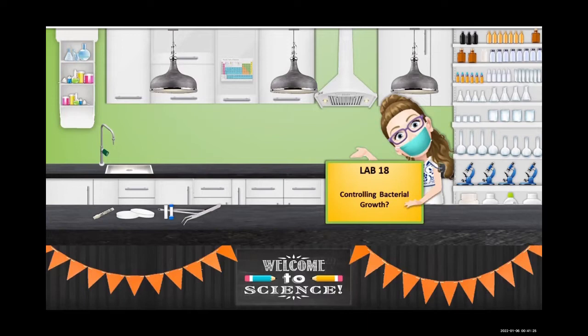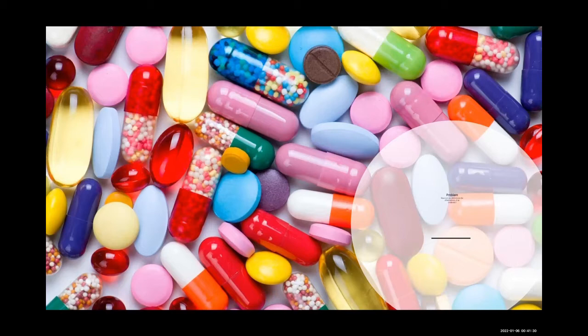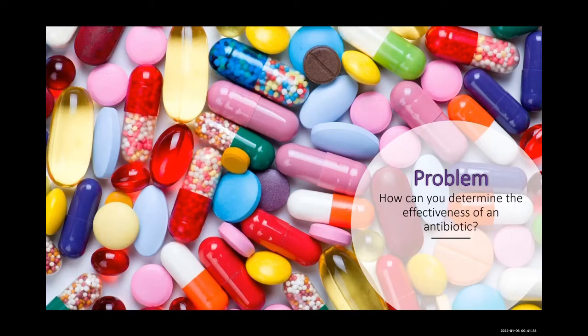18, Controlling Bacterial Growth. Problem: how can you determine the effectiveness of an antibiotic?